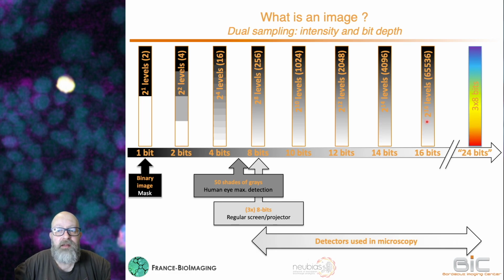Of course, it will occupy a larger part of your memory as compared to 8-bit, but it will be more precise, especially if you've got a high dynamic of the phenomenon you're trying to quantify. If you have only black and white images, if the signal can be on or off, and that's it, you'd better stick to 8-bit. If you've got really subtle levels, subtle changes and so on, you would opt for 16-bit image.